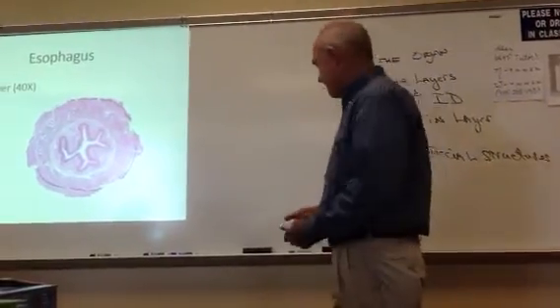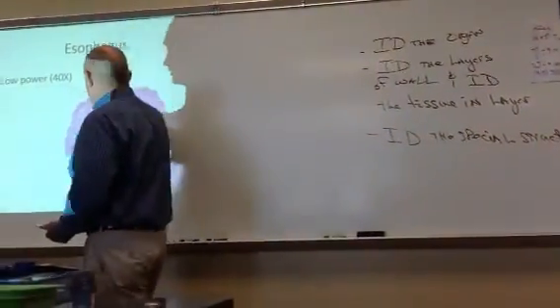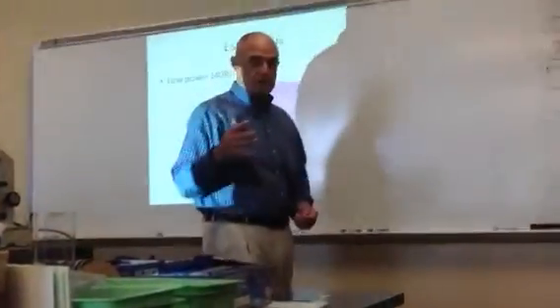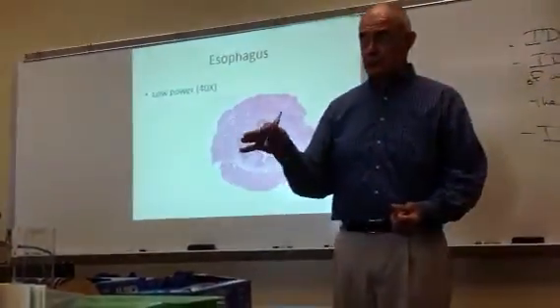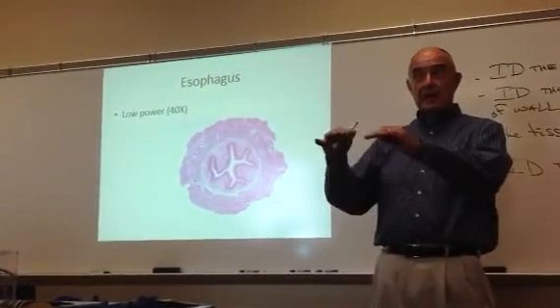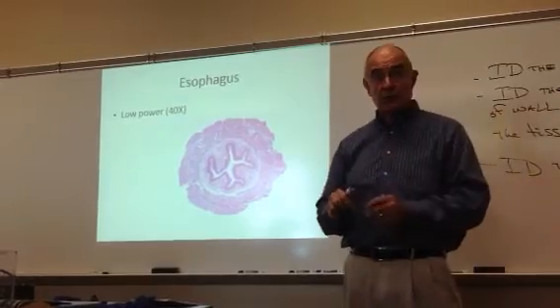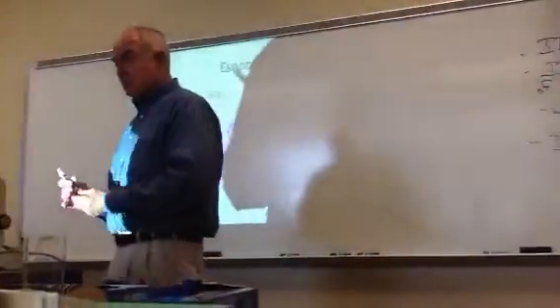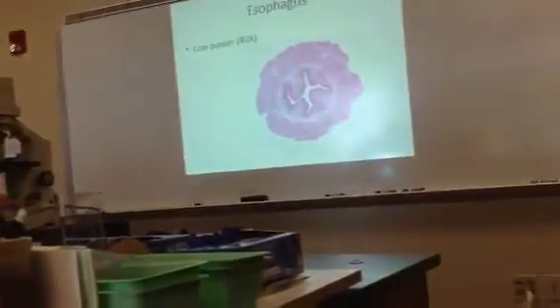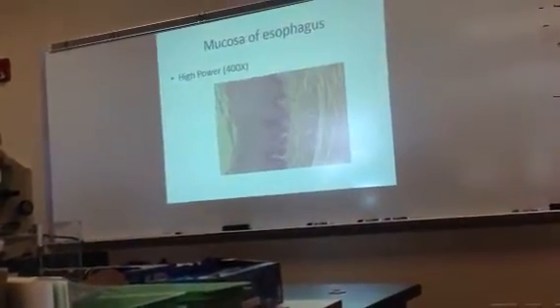Okay, so here's a low power of the esophagus. And remember, I like for everybody to study all three powers. Start with low power, go to medium power, go to high power if you need to, in order to see these special structures and special cells. Okay. Then on the next slide, we simply go up in power.